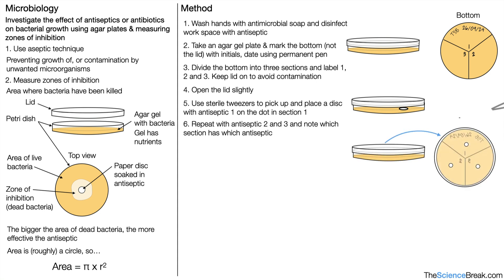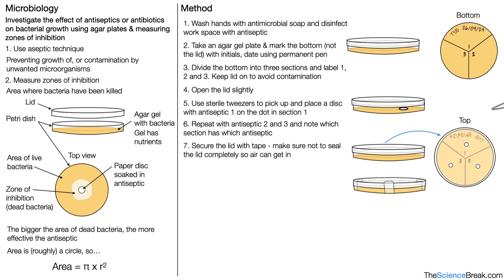We repeat with antiseptic 2 and 3, noting which section has which antiseptic. Taking a top view, we can see labels 1, 2, and 3 with our three discs. We then secure the lid with tape, making sure not to seal it completely so that air can get in and allow aerobic respiration. We incubate — in other words keep warm — at 25 degrees Celsius for about 48 hours. We can then see our dish has zones of inhibition for the different antiseptics.